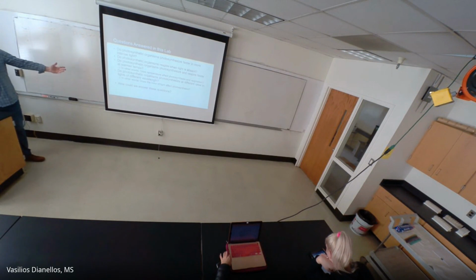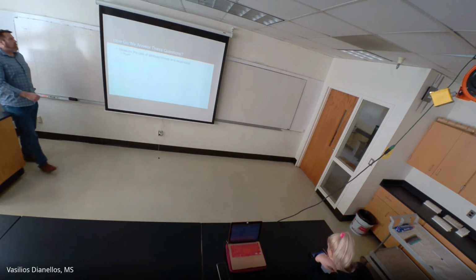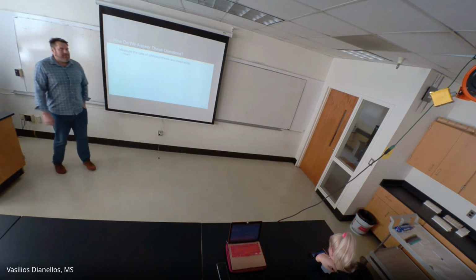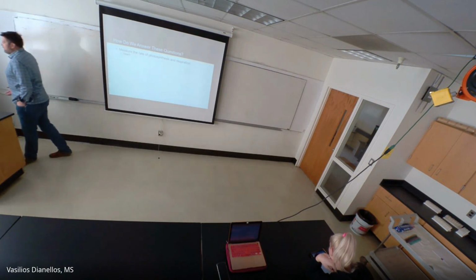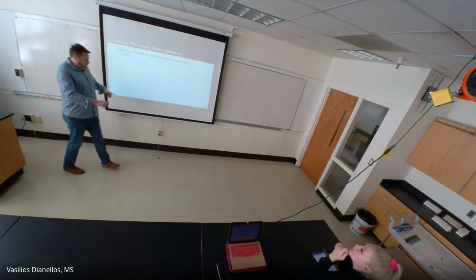So how do we answer these questions, right? That's what we're talking about next. How do we measure the rate of photosynthesis and respiration? Does anybody remember, and I don't blame you if you don't, because we only brought it up today, does anybody remember the equation for photosynthesis?